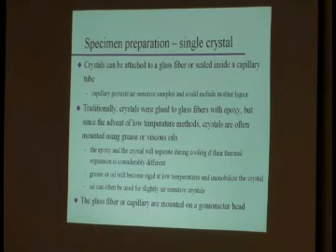How you mount it exactly depends on what your crystal is, whether you need to protect it a little bit from air, and who teaches you. The first way I was taught how to mount a crystal was, well, you need grease. And inevitably, almost everybody uses too much grease. Okay, you take that fiber, you dip it in some grease, you have too much grease on it. So our crystallographer at Georgia Tech used to say, here's an easy way to get enough grease. Take that glass fiber, do this. Just touch your forehead with it. If you have a small crystal, you pick up enough grease from your skin that the crystal will actually stick to it. And believe it or not, it actually works, okay?